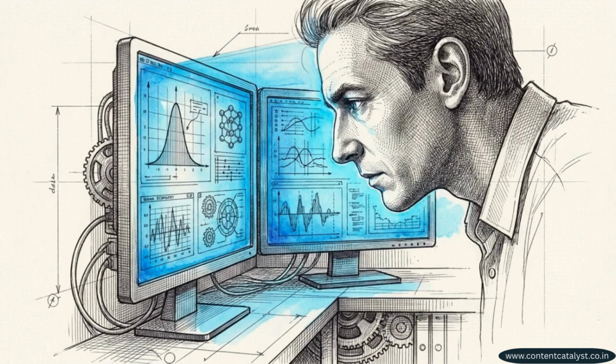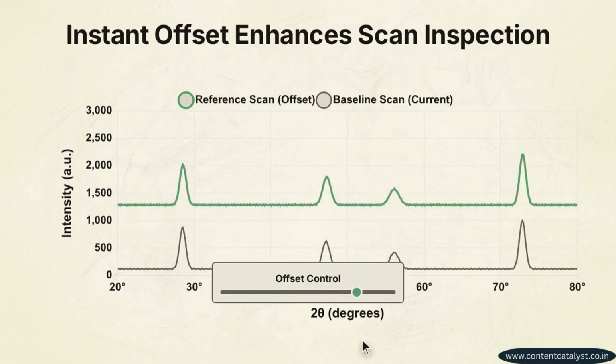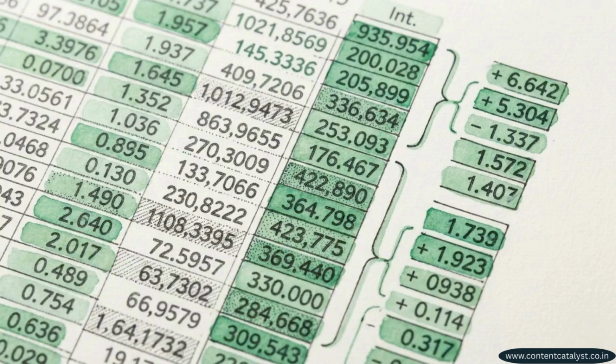While instantaneous plotting sounds like a minor quality of life update, it directly influences researcher behavior. When the data moves the moment you interact with it, you inspect the scans much more frequently. Stripping away interface friction forces deeper engagement with the raw data, and continuous visual inspection is exactly how you catch a fragile, overfitted model before it becomes a published conclusion.